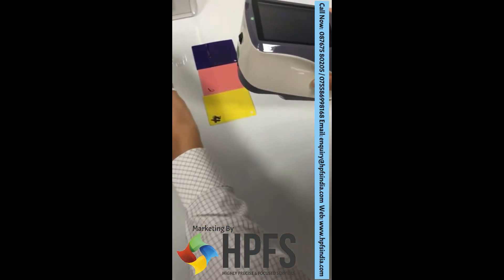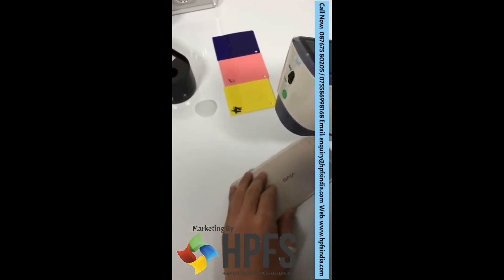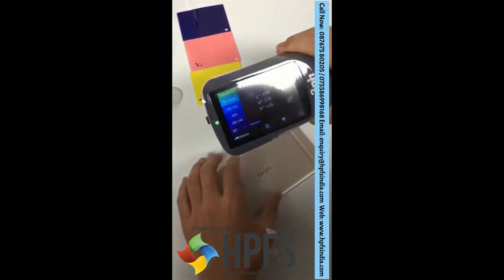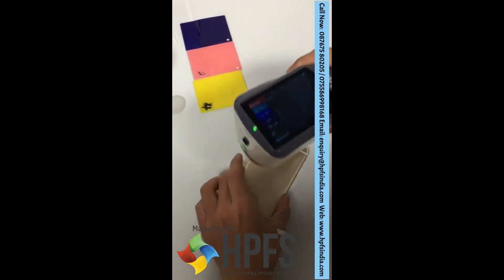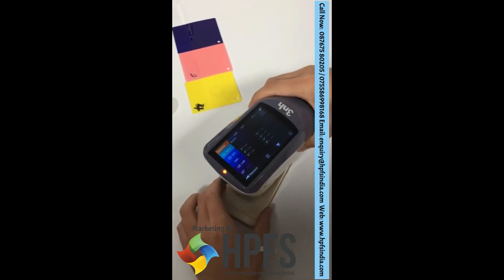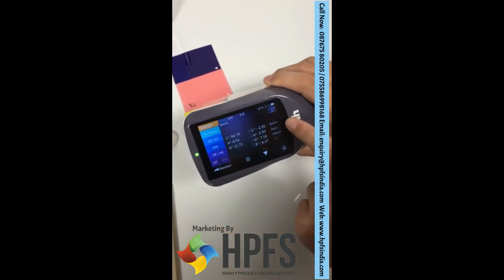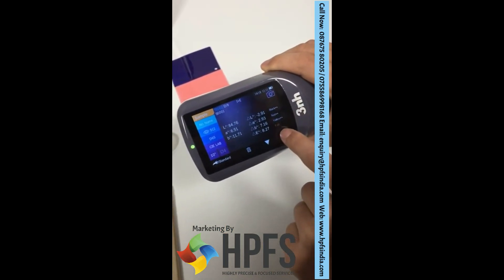Okay, it's ready for measurement. Measurement standard, and then measurement sample. This is the test result, this is the color offset indication, and this is the test result judgment.